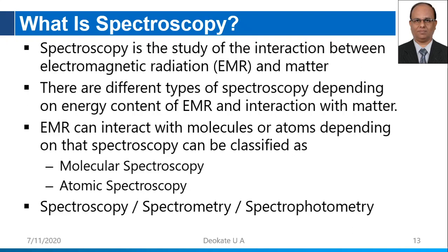The spectra produced by spectrometry are generally plotted as intensity versus frequency or wavelength. For example, in a mass spectrometer, a spectrum is plotted as intensity versus particle masses.